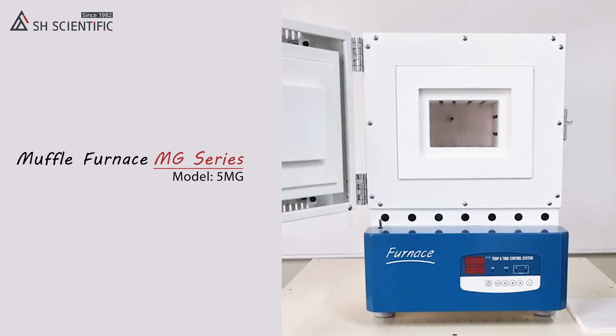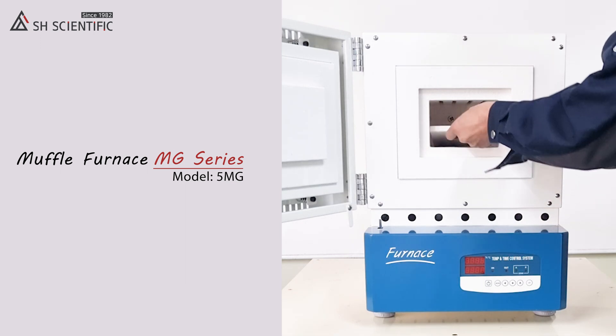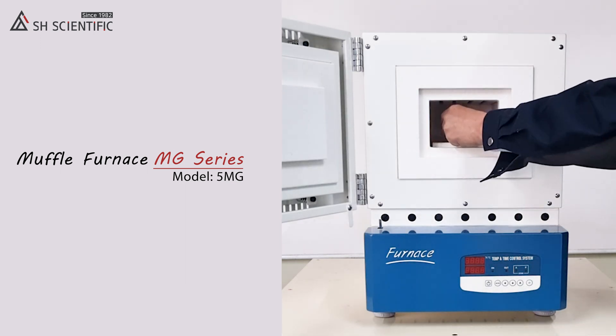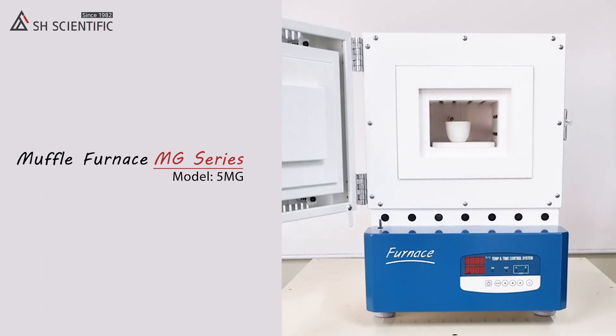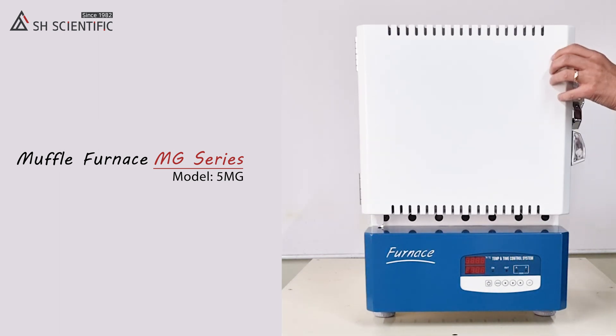As you can see, our MG series has heating elements on all four sides of the chamber. To start, insert the heating plate on the bottom and place your samples on it. The plate protects the heating element on the bottom from liquid samples and piling ash during your experiment.